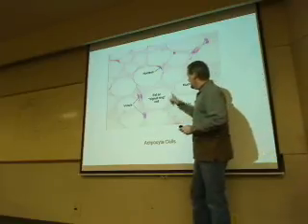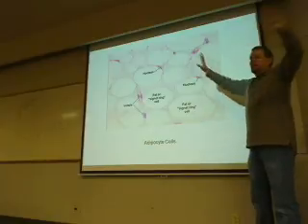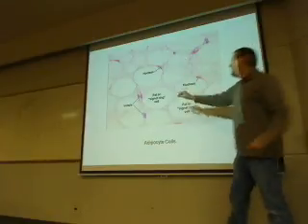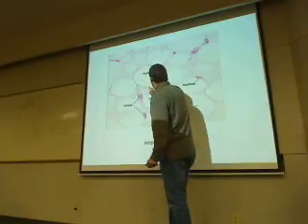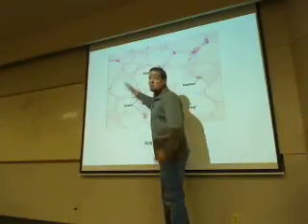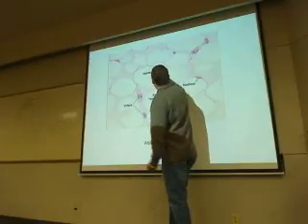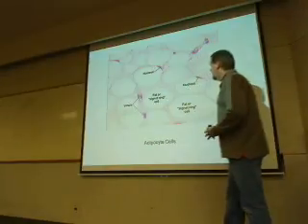When you take a look at this guy, the vacuole is so big, it pushes the cytoplasm out to the side of the cell. So this dark streak that you see is where all the cell machinery is at, and this is all just a gigantic oil droplet, or fat. And the nucleus gets shoved way over here and bulges to the outside a lot.